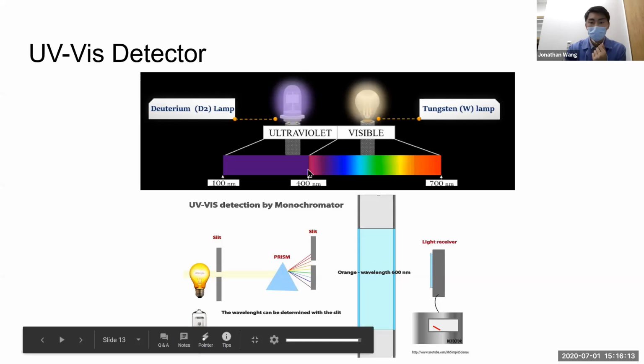Basically, just because your eyes can't detect this electromagnetic wave, your samples will still have very distinct properties in this region. So what's known as UV-visible detection, by this light detector. Our machine uses a prism to isolate some regions of light to shine onto your sample and see how much passes through. And basically that's the darkness or opaqueness of that sample.